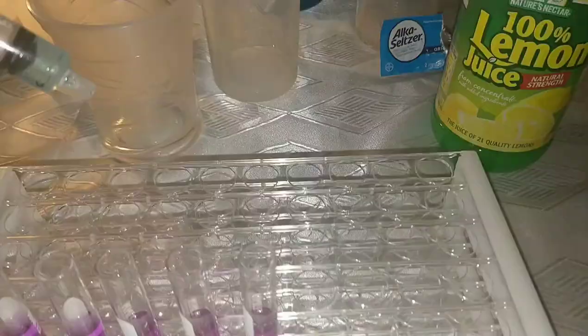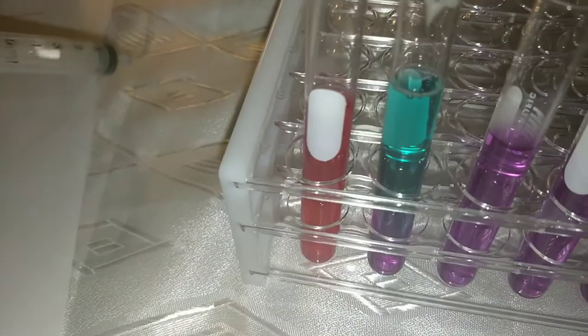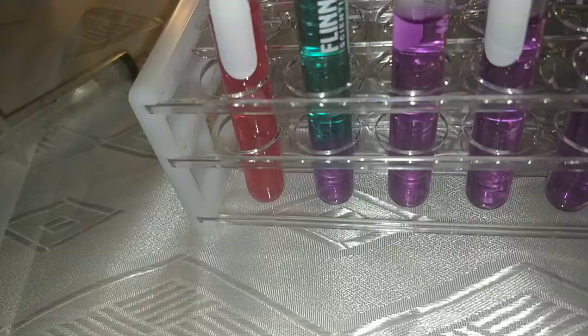Here we have one milliliter of the ammonia — it turns a deep blue. In reality it looks more green, so I'm going to note it down as green.